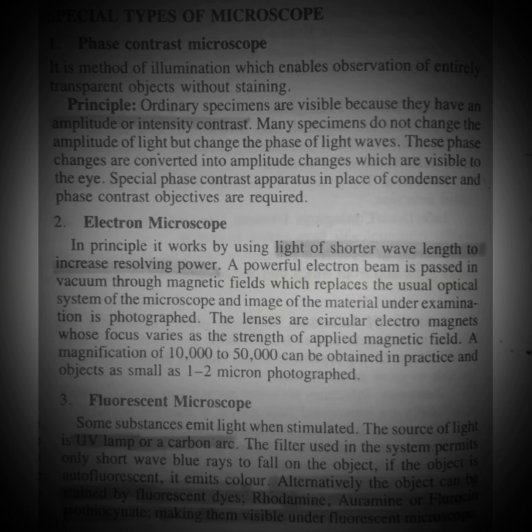So from these five, there is the compound microscope as well and some other microscopes also, like bicolumnar, I forgot the name, a monocolumnar. So these different types of microscope are there. Okay, so from this I'm just going to tell about the special types of microscope. Here you can see there is phase contrast microscope, electron microscope, and fluorescence microscope. These are the special types of microscope, they carry some special function in themselves. So I am going to tell you each of these separately.